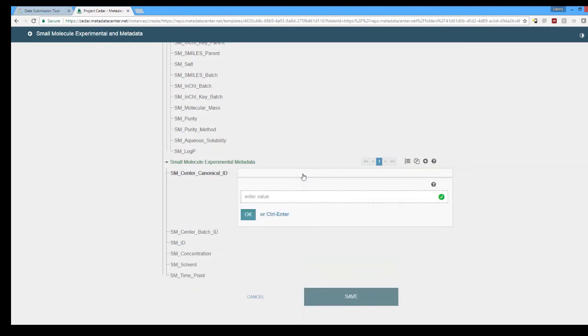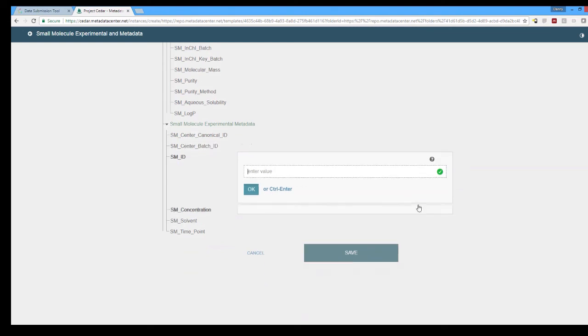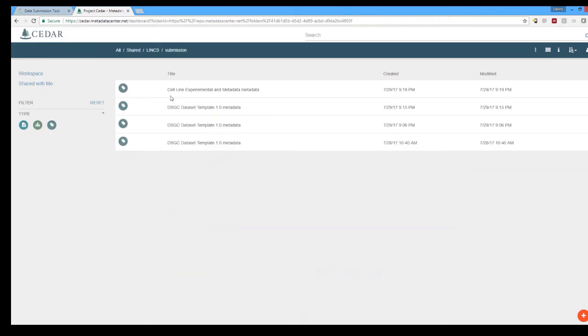One of the other great things about CEDAR is having these small question marks on the right side of all of the individual fields. This gives a description of the field saying to the user exactly what it is that we expect in that particular field.